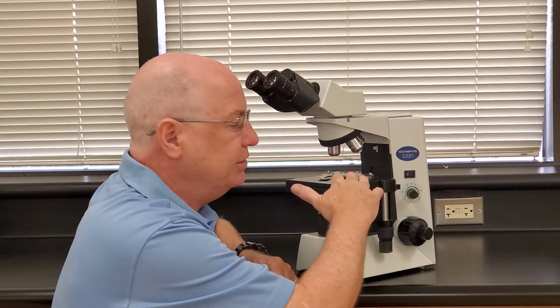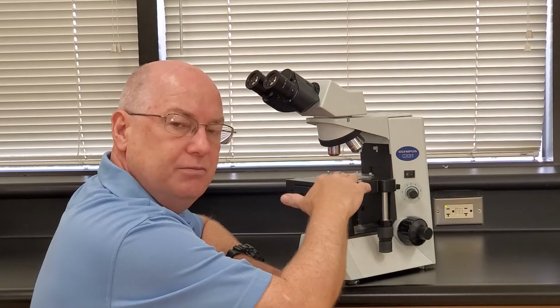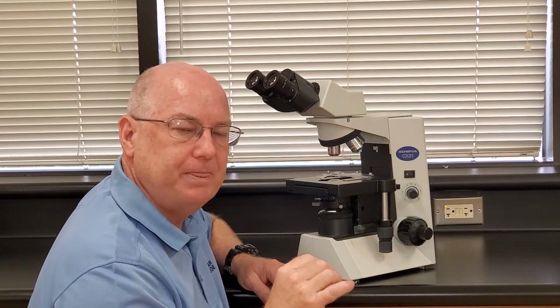Some old school microscopes don't have a mechanical stage. It's a fixed stage. We don't have that. So ocular, revolving nose piece, mechanical stage. Now, these structures that are on the revolving nose piece are called objectives.